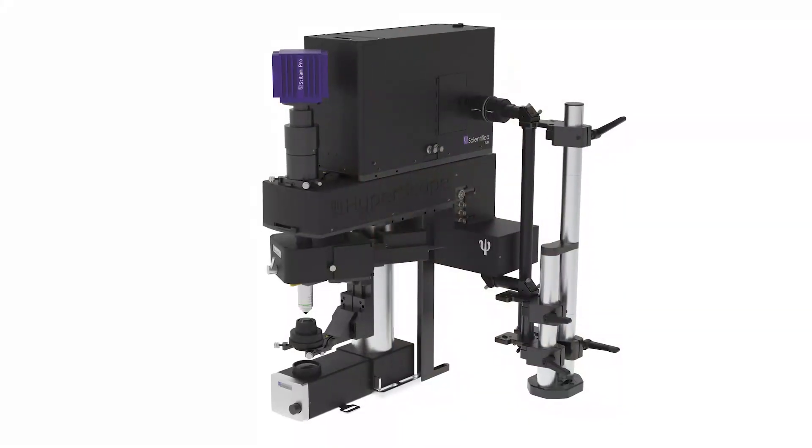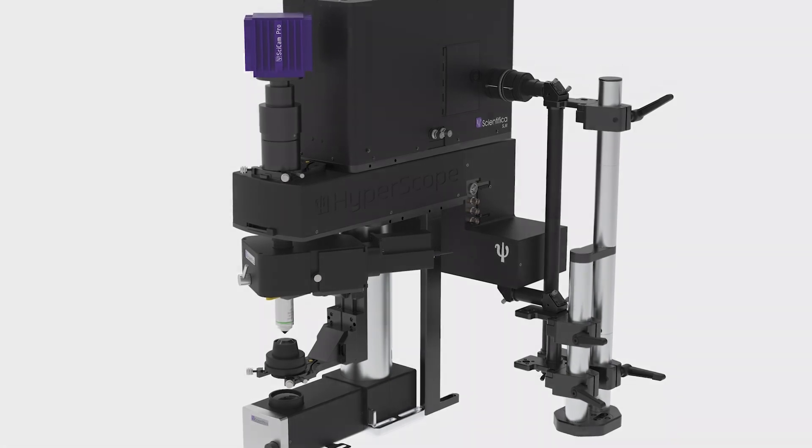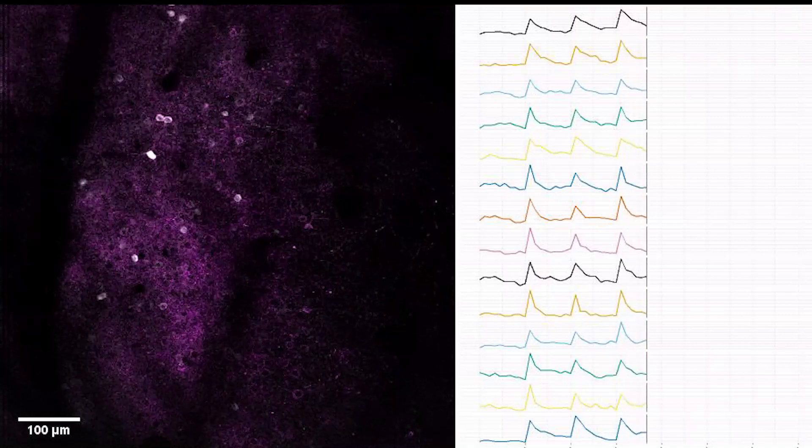Holostim 3D combines the best of spatial light modulation and multiphoton technology. It seamlessly integrates the full power of HyperScope imaging and SLM routines, allowing our customers to drive rapid and high-throughput photo stimulation using the latest optogenetic tools.